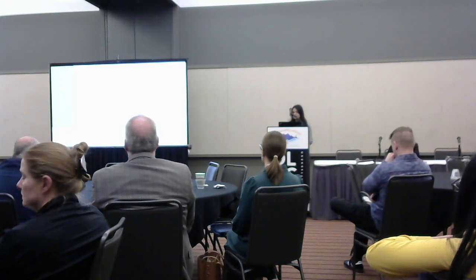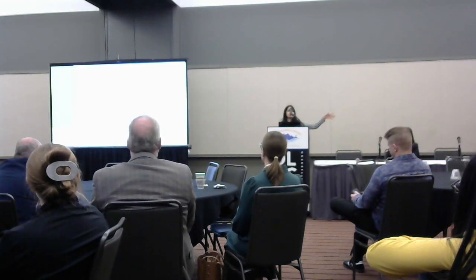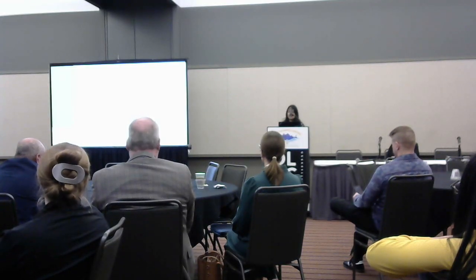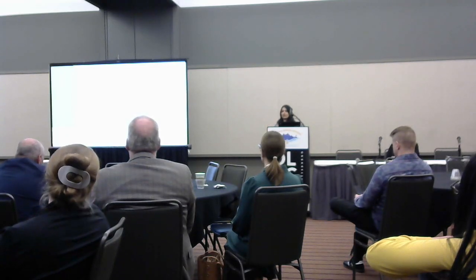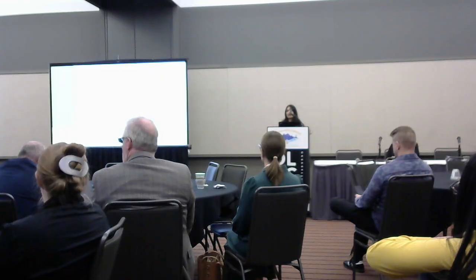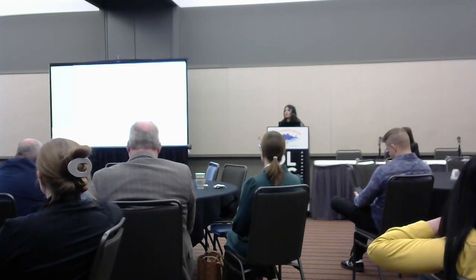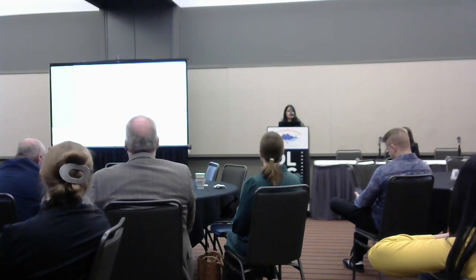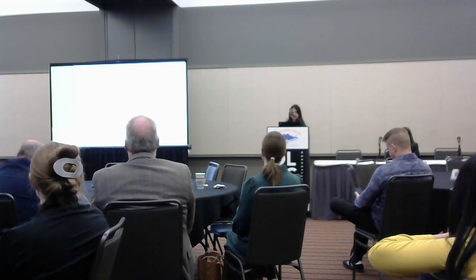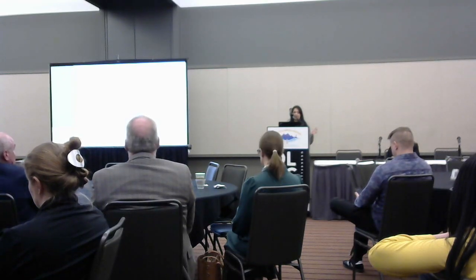A few lessons learned. I do feel that cores are in a unique position to bridge the gap between our researchers on one side and IT on the other. Whatever progress we have made was a true partnership between the core and our IT team. We have a regular monthly meeting with members of our research IT and scientific computing to talk about where the bottlenecks and challenges are, and what we can do to make this whole experience better for our researchers. And it has been helpful to have a basic common pipeline as an actionable start, so we have something to work on together.